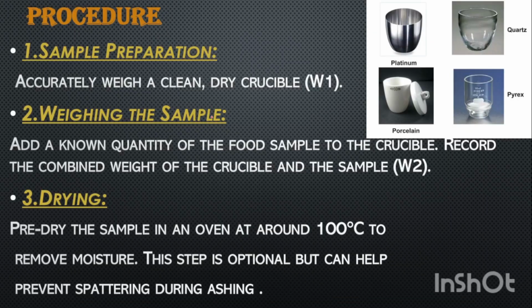Next, coming to the determination of the ash content in the food. Why do we measure the ash content in the food? Ash determination of food samples is part of the proximate analysis necessary for nutritional evaluation. This ensures the safety of foods, making sure that there are no toxic minerals present. The ash content in food can also impact the taste, texture, and stability of the foods. So, it is vital to know the mineral content for quality control purposes.